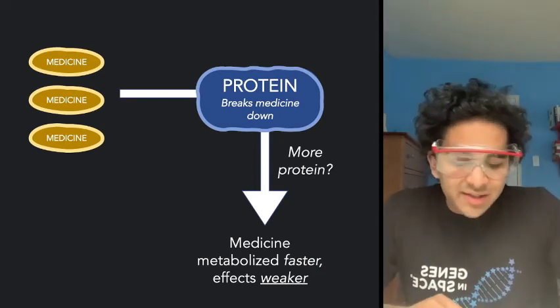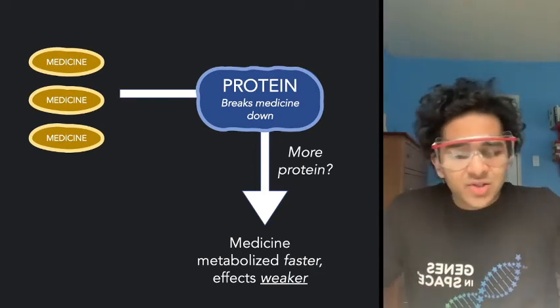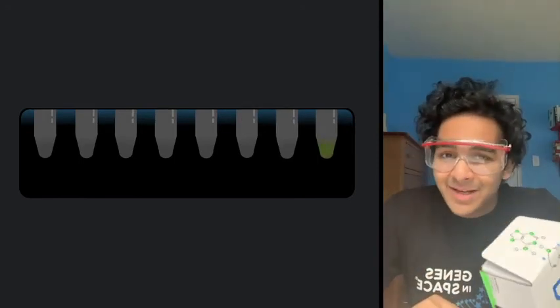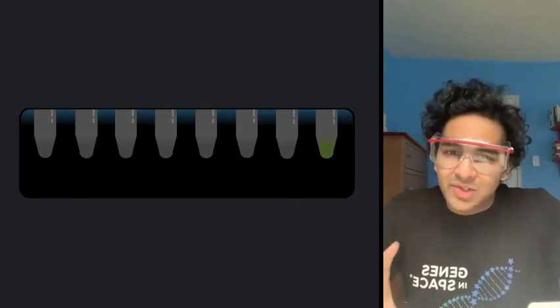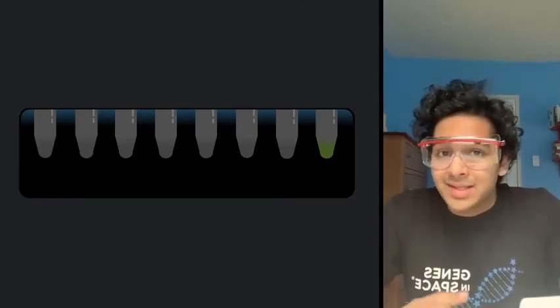So after a few cycles of PCR, let's say maybe 10, I'll transfer all 8 tubes to the P51, turn on the light, and it looks like the fluorescence isn't strong enough to see yet. But that's not a problem, because I can just repeat this process every 2 cycles until eventually I start to see some fluorescence in the last tube. Great! So based on this signal, it seems like there was more RNA for gene X in the last tube than there was in the others.